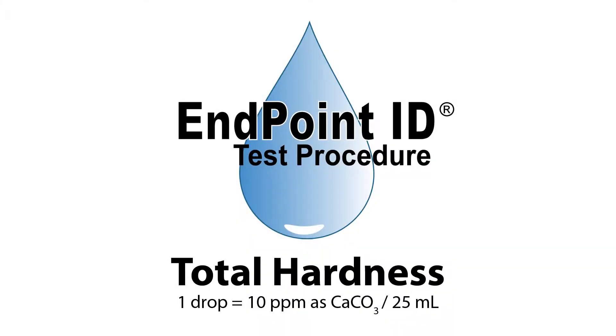This is a demonstration of a total hardness drop count test kit using Endpoint ID procedures.